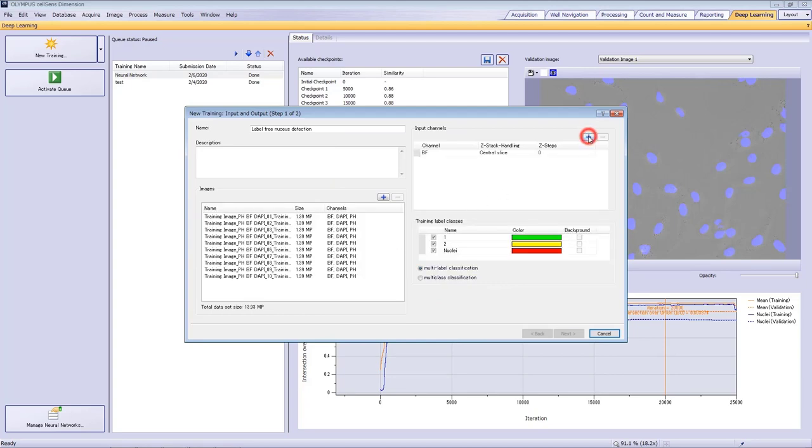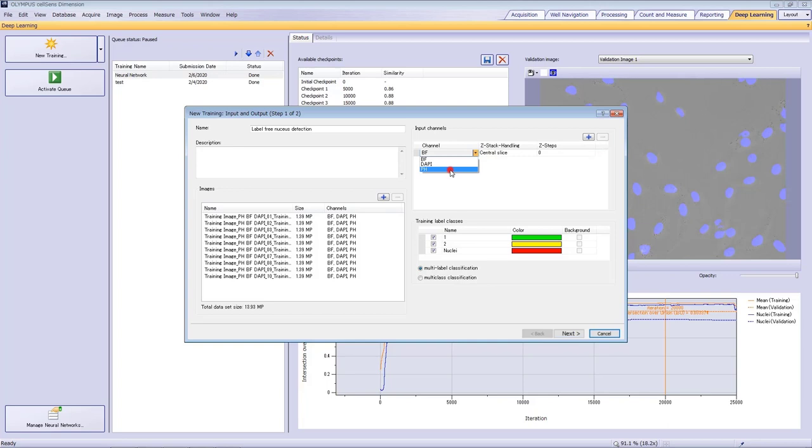Then, choose the input channel. For label-free nucleus detection, you'll select the transmitted light channel. However, since we're going to use the training data to detect nuclei from phase contrast images, select pH instead of transmitted light.